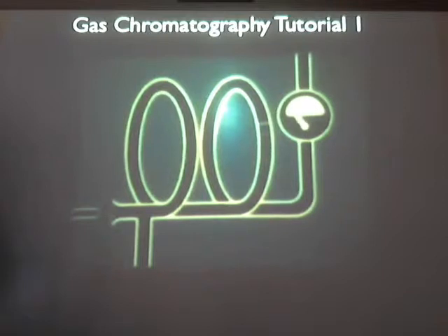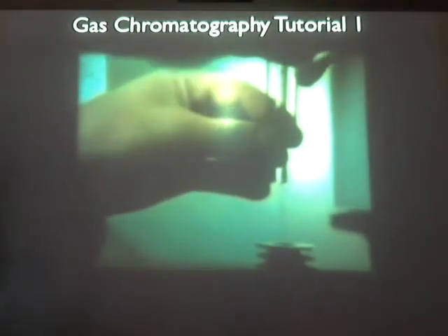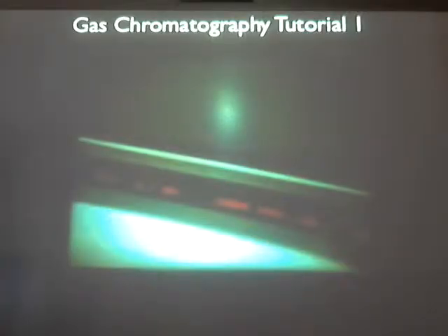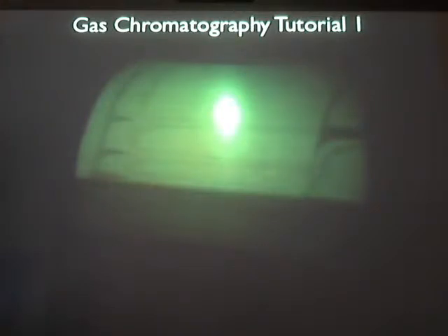Since each of the constituents of a mixture has different chemical and physical properties, some will be more slowed down by the adsorbent than others. So they move through the coil at different speeds. So you squirt the mixture in at one end, and by the intensity of the signal given off by each compound at the other end, you can read off the different constituents.